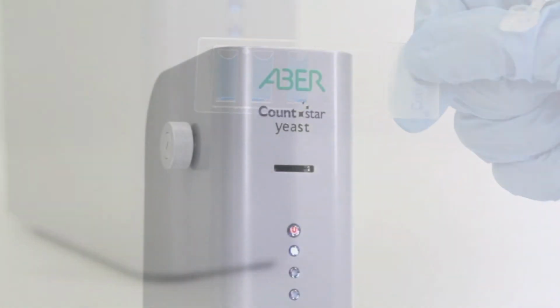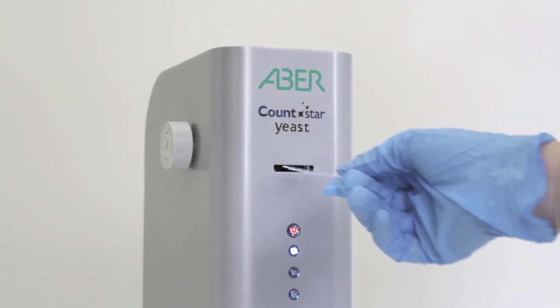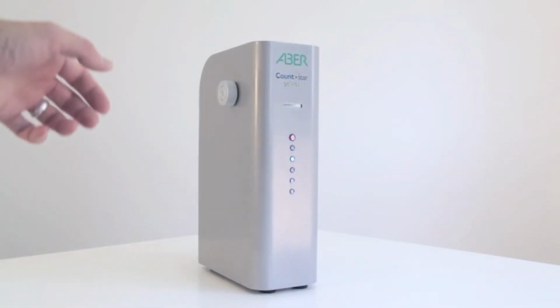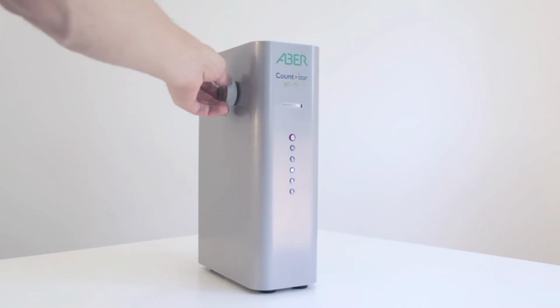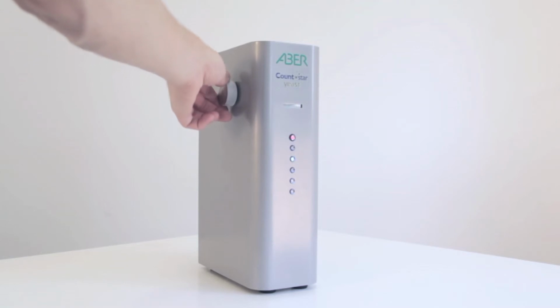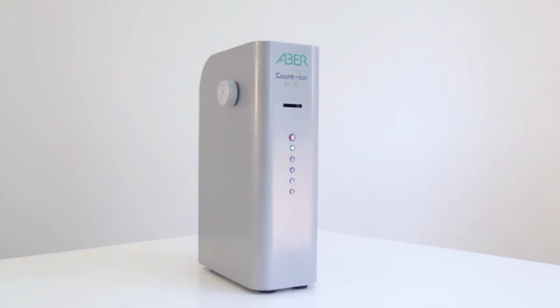The CountStar Yeast has a power indicator on the front of the instrument, which lights up when the instrument is switched on. The CountStar slide is placed into the slide port. The slide can be easily manoeuvred using a slide feeder wheel on the right hand side of the instrument. You can also see 5 LED lights on the front of the instrument, each representing one of the 5 chambers in the slide. The LED corresponding to the appropriate chamber in the slide lights up when in view of the camera.